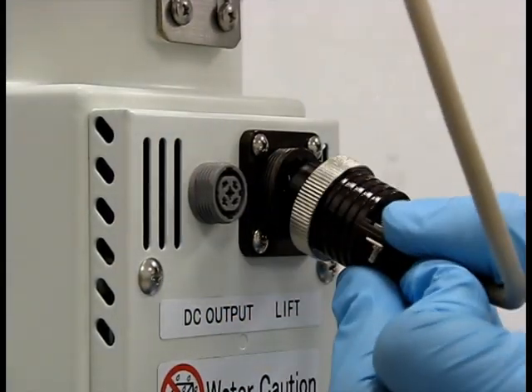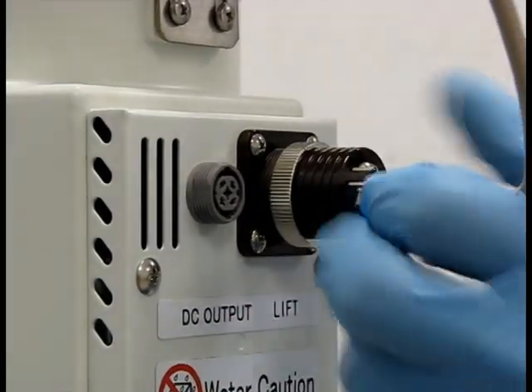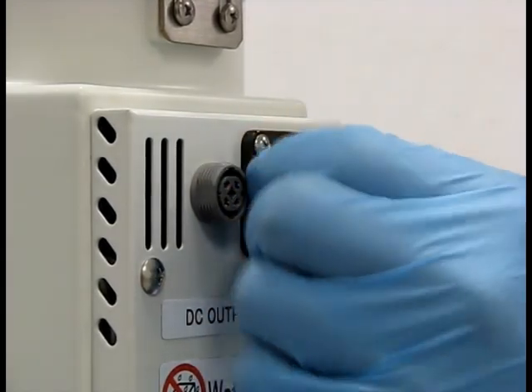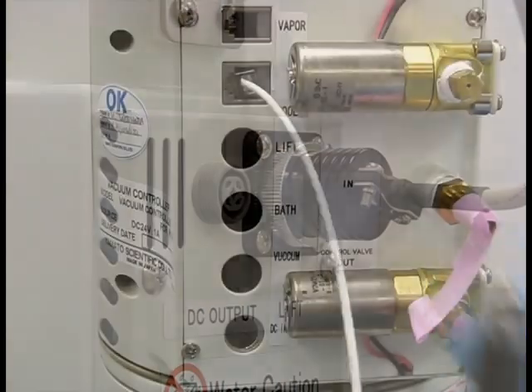Connect the rotor lift harness to the back of the rotary evaporator. The larger plug will connect to the main body, while the smaller plug will connect to the lift terminal on the vacuum regulator.